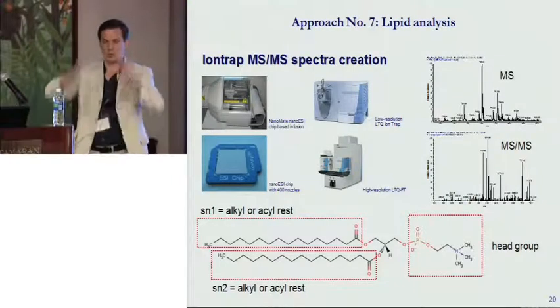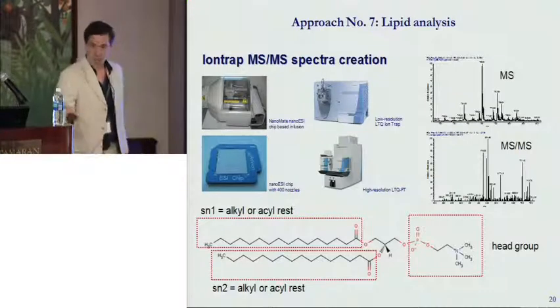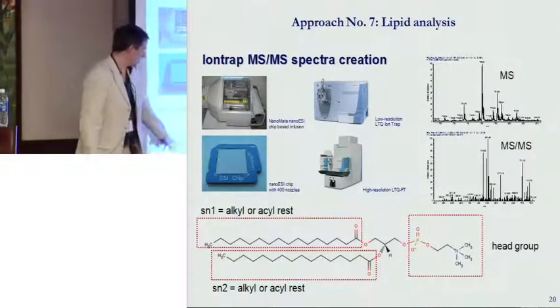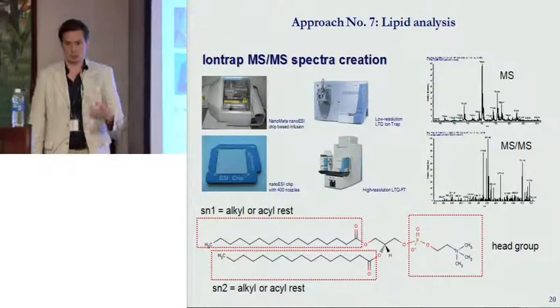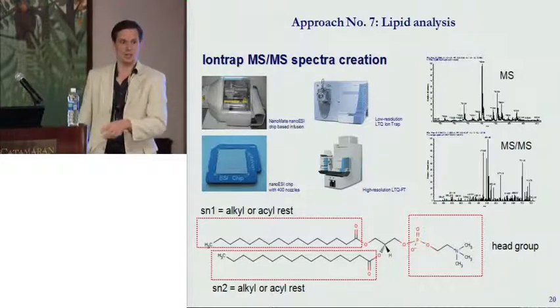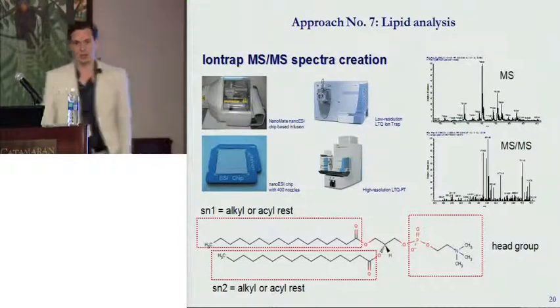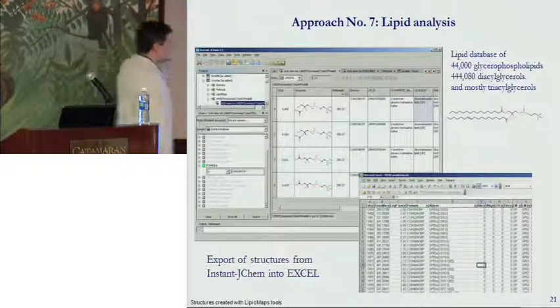So if you have a database of maybe 1 million lipids, you can just fragment them with Reactor, for instance, by saying, please lose this side chain, and that one. Get the structures, convert them to accurate masses, and look up the accurate masses, for instance, in a real spectrum. So this is the way we, in principle, did it.